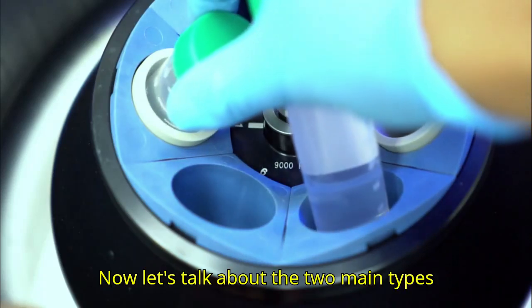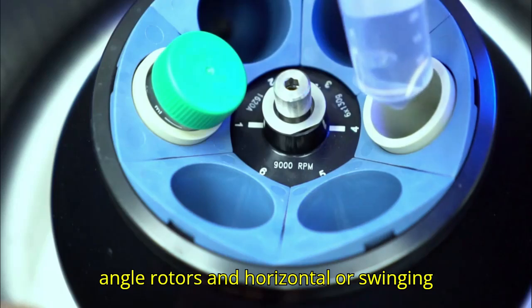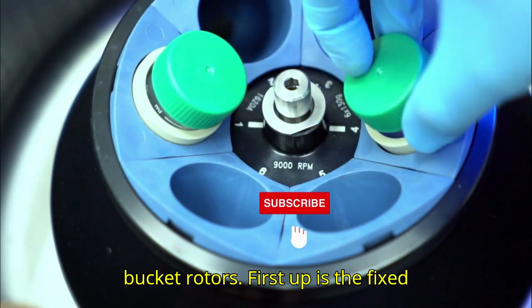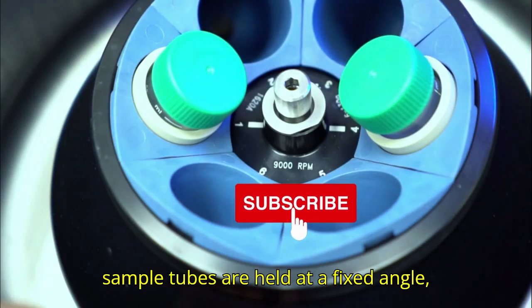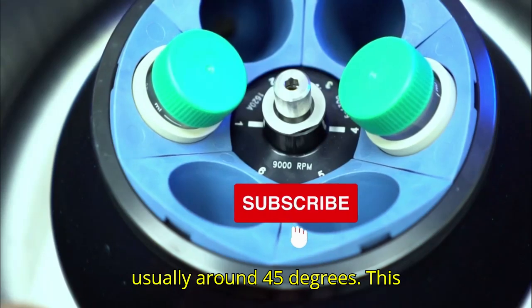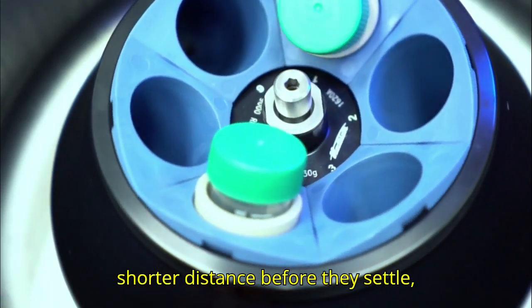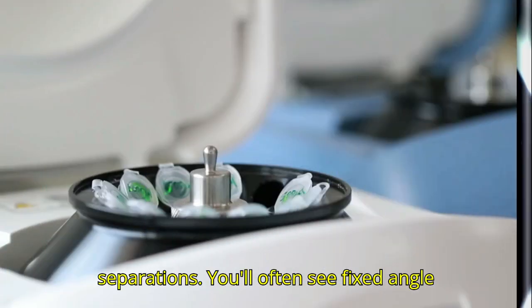Now, let's talk about the two main types of rotors used in centrifuges: fixed-angle rotors and horizontal or swinging bucket rotors. First up is the fixed-angle rotor. As the name suggests, the sample tubes are held at a fixed angle, usually around 45 degrees. This design means particles move along a shorter distance before they settle, making this rotor ideal for rapid separations.